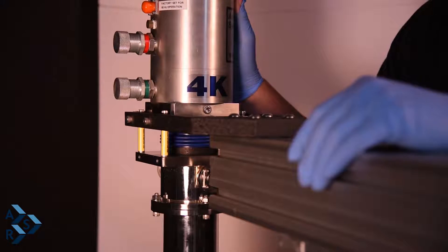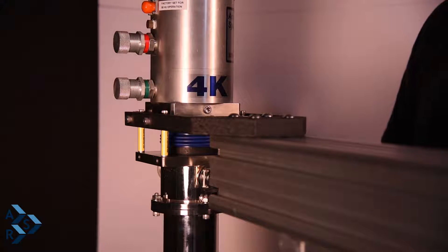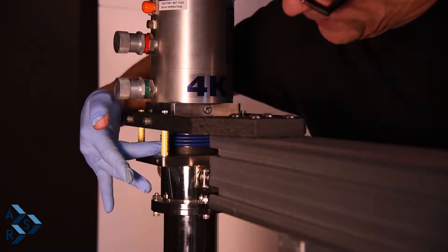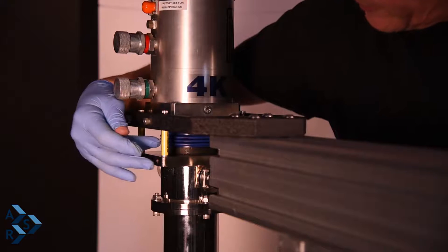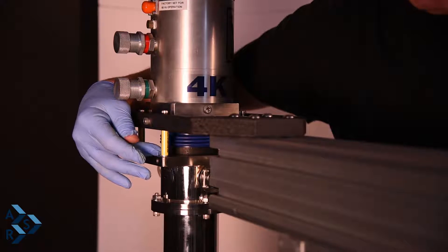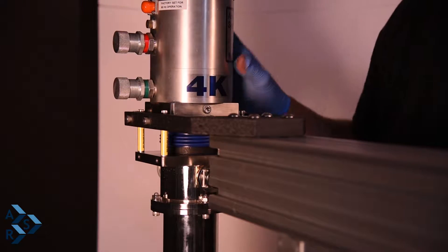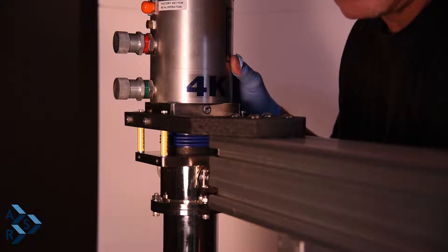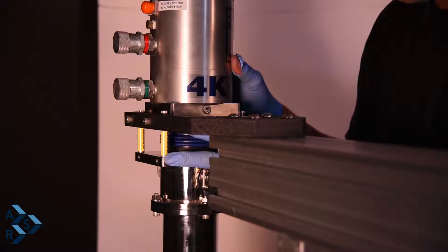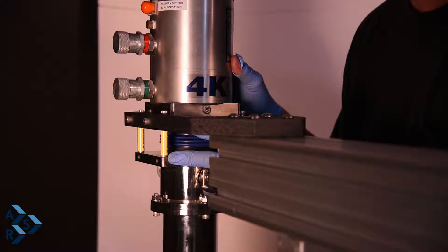At this point you want to make sure that you maintain the distance between the two flat surfaces, right where the standoffs are. We want to maintain 1.62 inches to 1.75 inches in between. If you go above 1.75 inches, you're going to move the cryostat further inside the annular space and that's going to change your temperature on your sample. For optimum temperature, maintain the same distance as the standoffs to get the best temperature from your system.